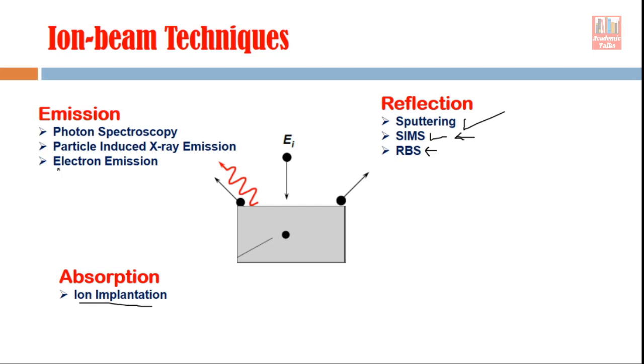And there is a possibility of electron emission also. All these phenomena give rise to certain techniques. Some are characterization techniques and some are processing techniques. But in today's lecture, our focus is on the discussion of SIMS.